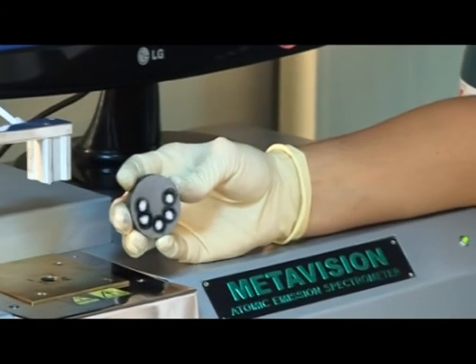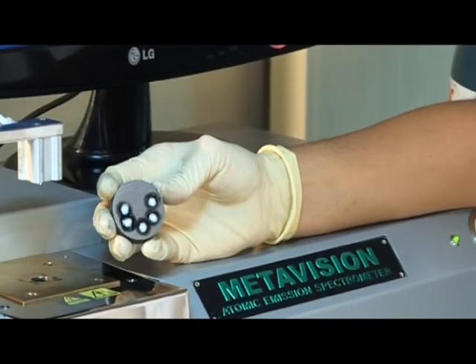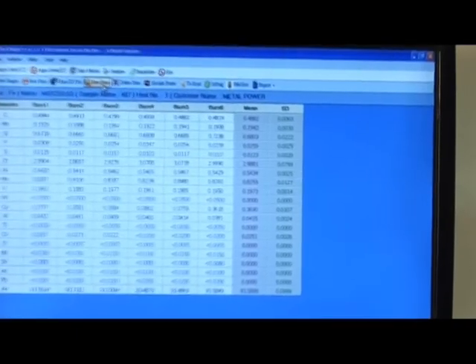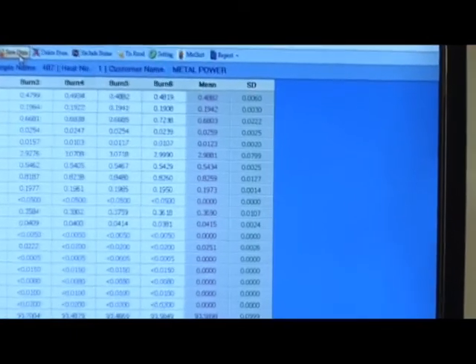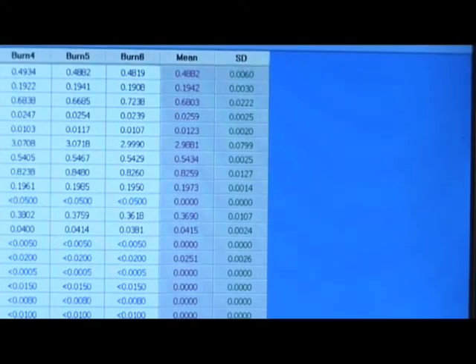Multiple burns can be taken if needed. Individual burn analysis as well as mean and standard deviation values for each element get automatically displayed.